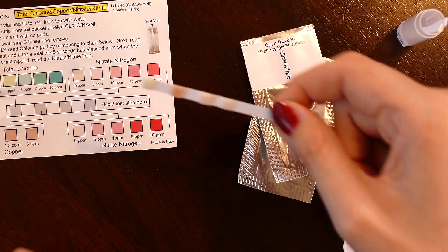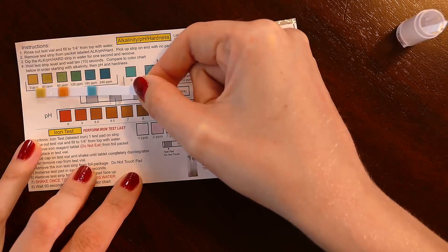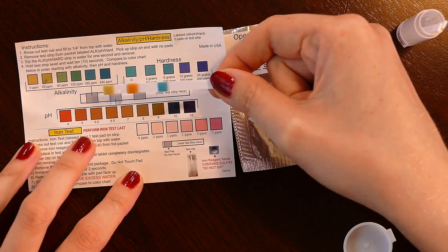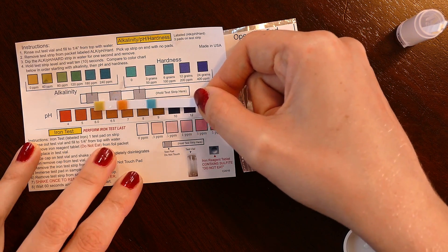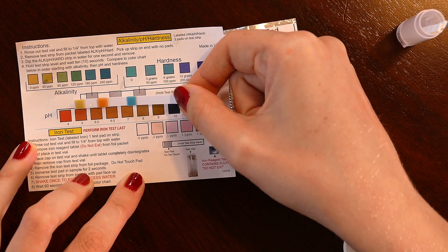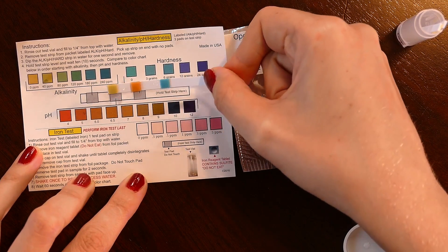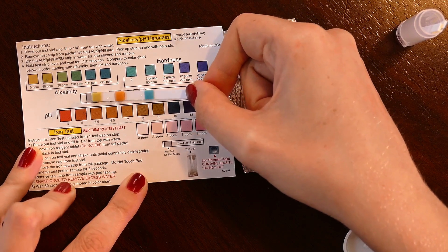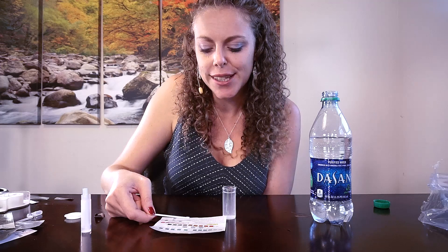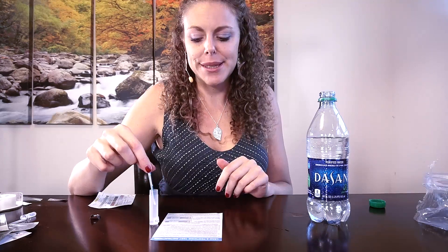Dasani is actually doing pretty well on these tests. On alkalinity, the Dasani bottled water is looking like 40 parts per million. pH looks like somewhere closer to 6.0. Hardness is around three grains, or 50 parts per million. The iron test on the Dasani also looks very low — probably zero parts per million.